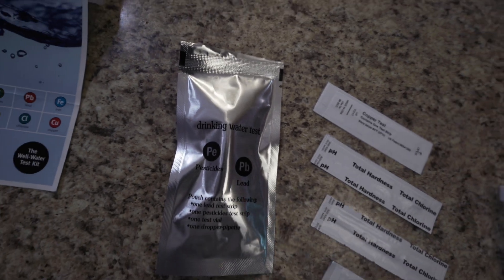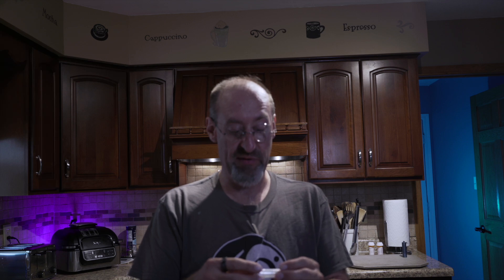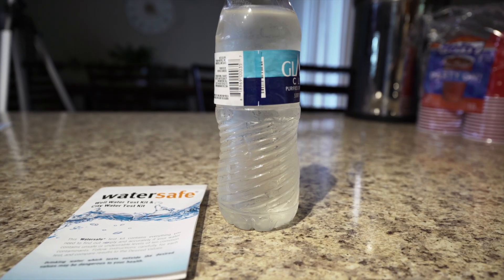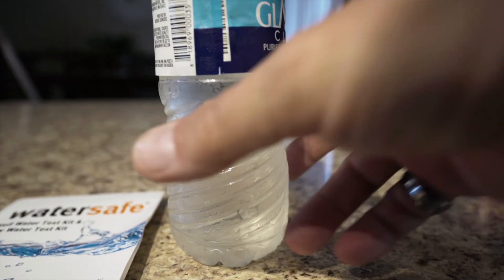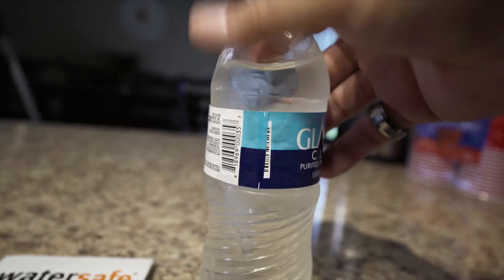Here's the test for pesticides and lead, here's the test for copper, here's the test for total hardness, and this is the nitrite test — we have a little vial with some powder in it. Here's a quick shot of the water as it looks straight out of the well. The bottle's a little frosty; it's fairly clean, maybe with a little bit of a tinge to it.